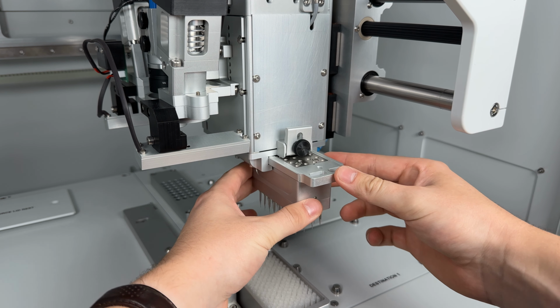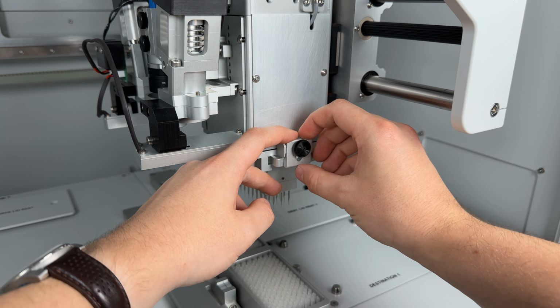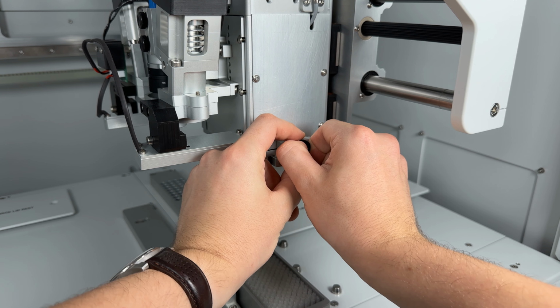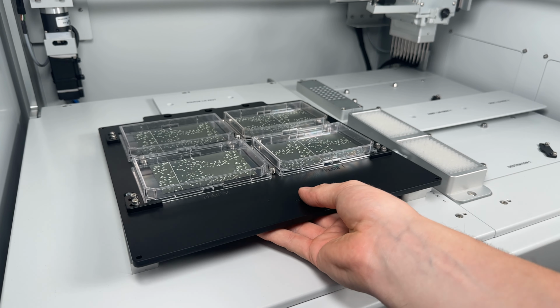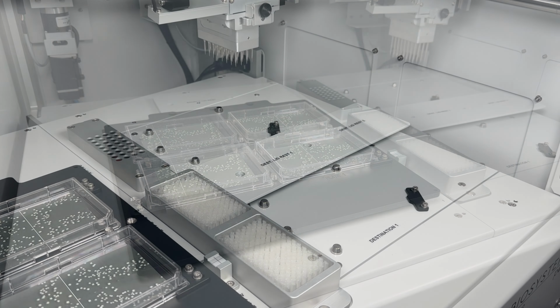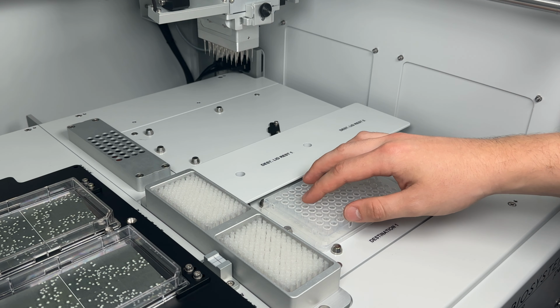Modify each aspect of the run to the user's discretion, and watch as the unit calibrates, cleans, locates, and picks colonies. Place the desired source tray and destination plates that have been selected in the run setup screen, making sure they are seated and positioned correctly.